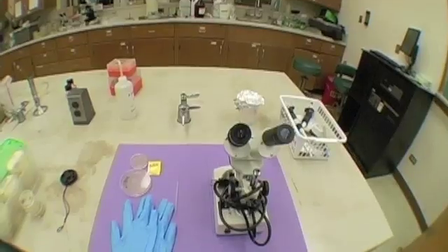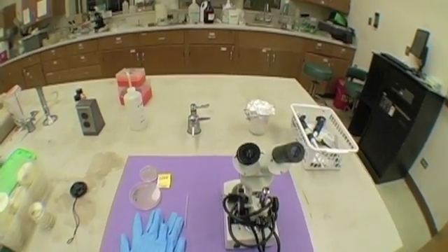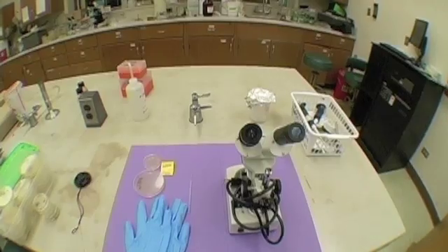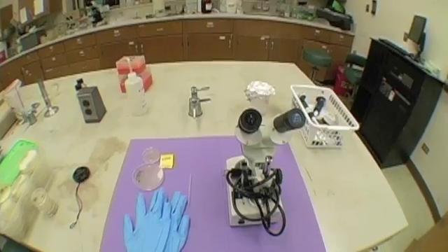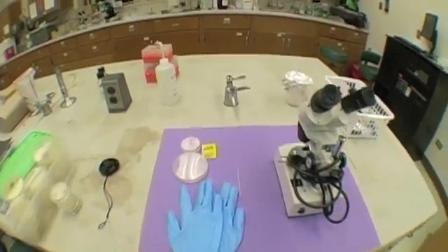Step two: picking the C. elegans worm. What you will need: a pair of gloves, two petri dishes, a set of matches, and a dissecting microscope. And don't forget your freshly made worm pick.